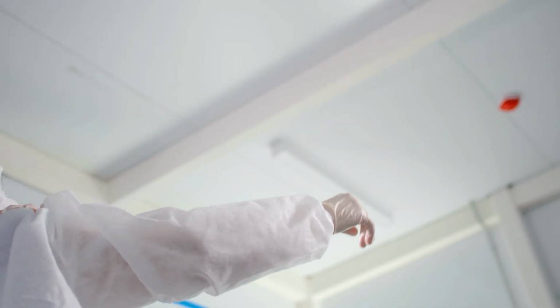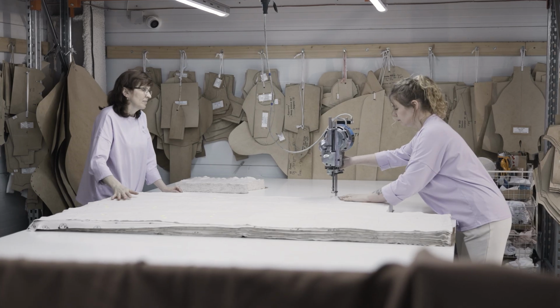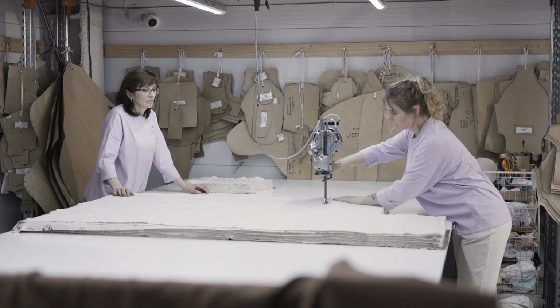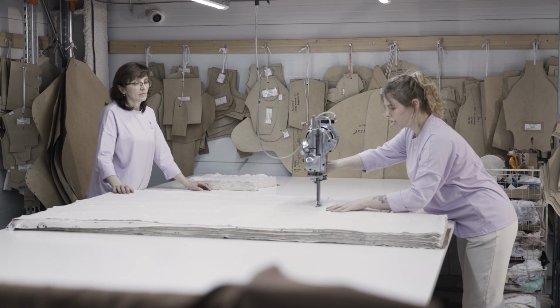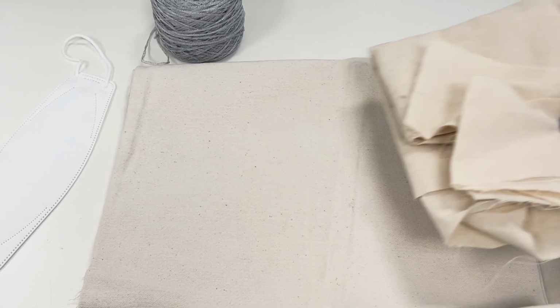present on its surface. And in the face of global health crises, antiviral textiles can help reduce the spread of infectious diseases. This standard is critical in ensuring that antiviral claims made by manufacturers are backed by rigorous testing. Here's how the testing process works.